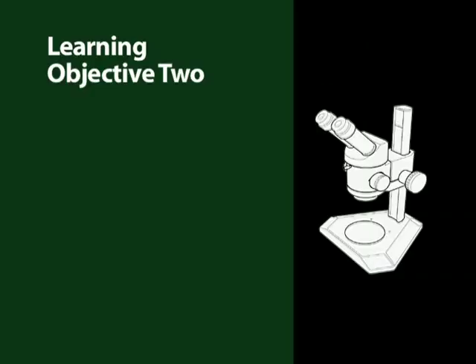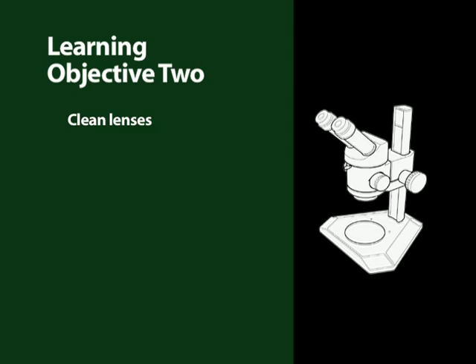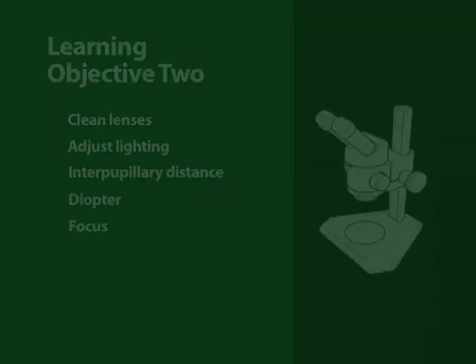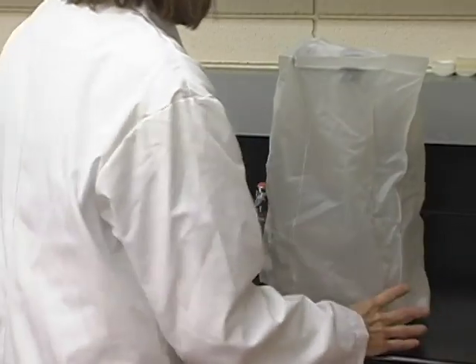The learning objective of this section was to set up, adjust, and use a stereo microscope. This included cleaning the external surfaces of ocular and objective lenses, adjusting the light, adjusting interpupillary distance, setting diopter adjustment, and focusing. Be sure to clean your ocular lenses and replace the dust cover before storing your microscope.